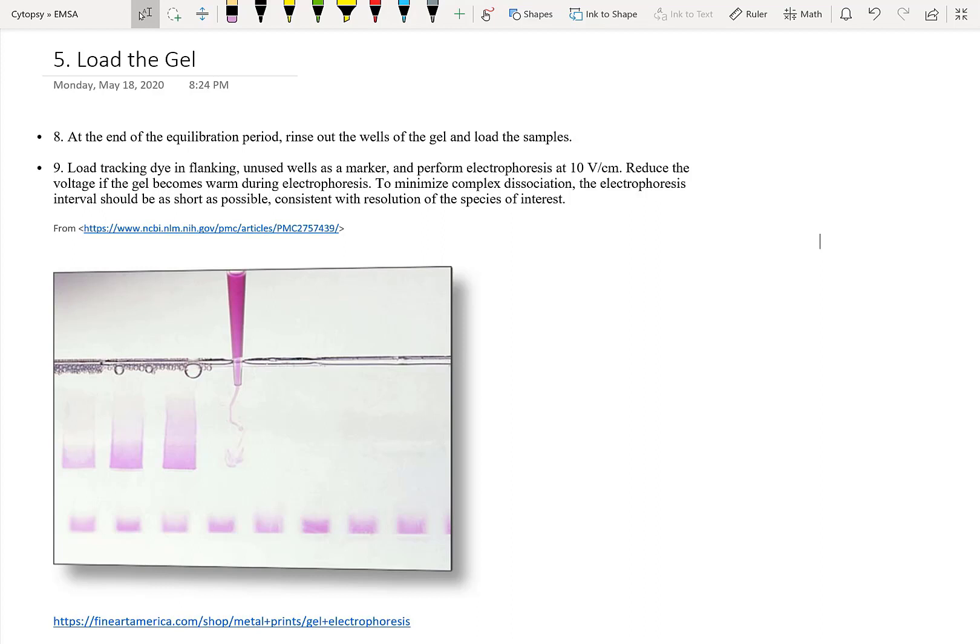Our next step is to load the gel with our sample. There's no real trick to it except that you should be using these gel loading tips. What they state here is to minimize the protein-DNA complex from getting dissociated, you should try to minimize the time that the gel runs. Also remember that any buffer that you use for your protein or for your sample or for your gel running buffer - all those buffers actually utilize the native running state. So that means their composition is very different than what you would use for SDS-PAGE, which has a whole bunch of detergents.